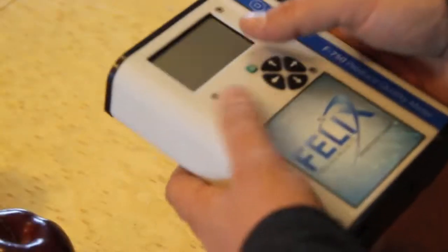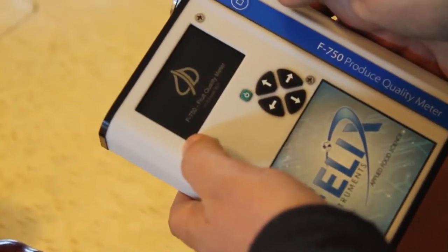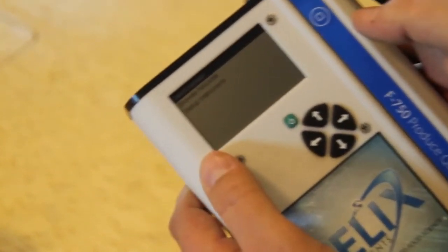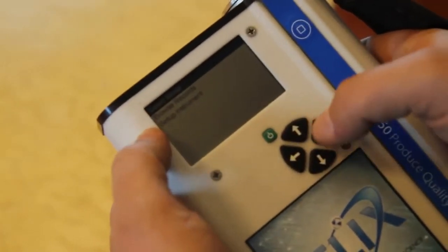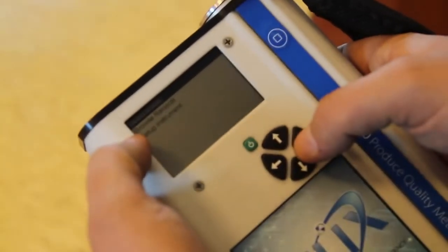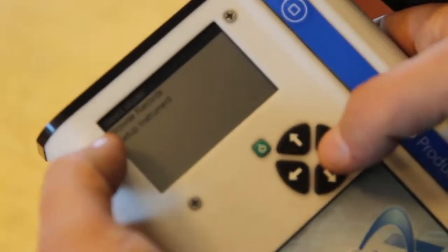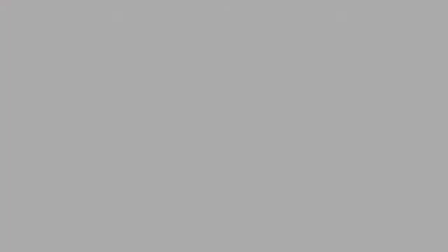To begin, we press the green power button to turn the F750 on. Immediately, we're presented with a simple list that has three options: Select model, browse records, and set up instrument.